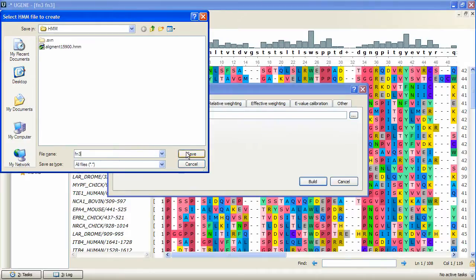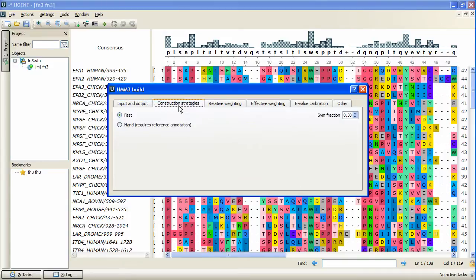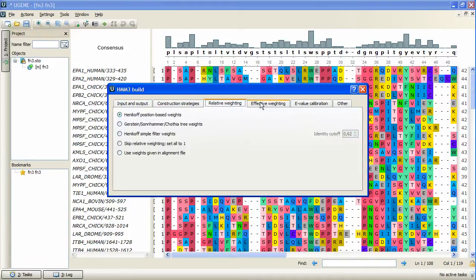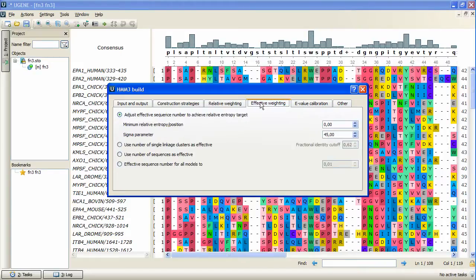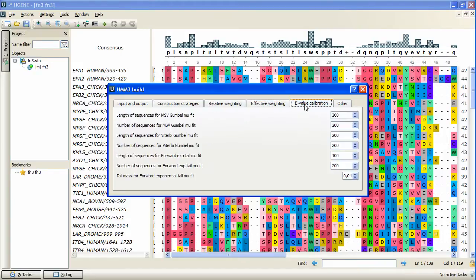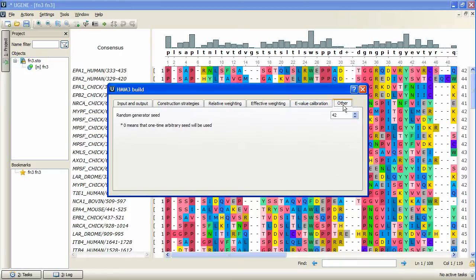It is possible to select the construction strategy, relative and effective weighting method, and adjust E-value calibration. The last tab, Other, contains HMMER 3 random generator seed parameter, which also can be specified if needed.